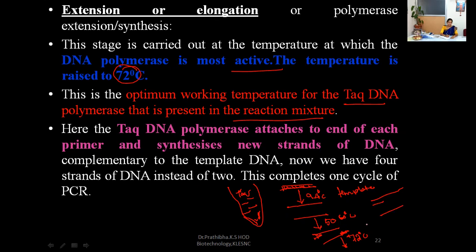What about the primers which are attached to the double-strand initiation region? When we increase the temperature to 72 degrees Celsius, the Taq DNA polymerase goes and binds to the double-strand initiation region and starts synthesizing the complementary DNA molecule, at 72 degrees Celsius.